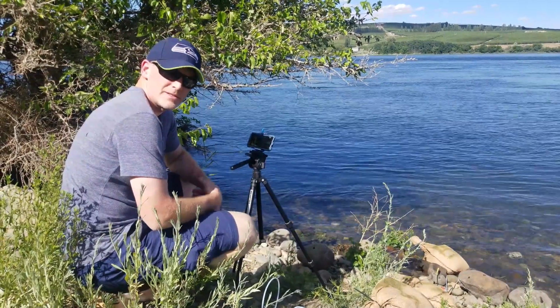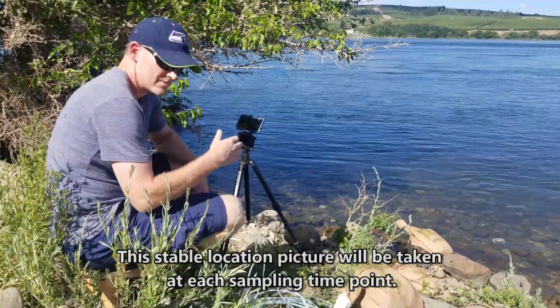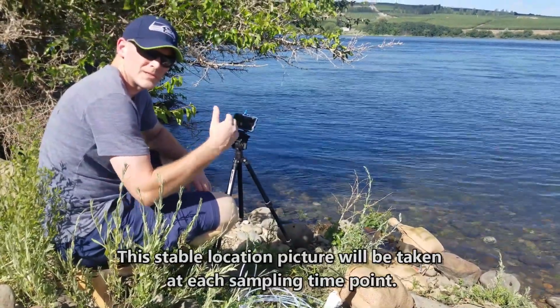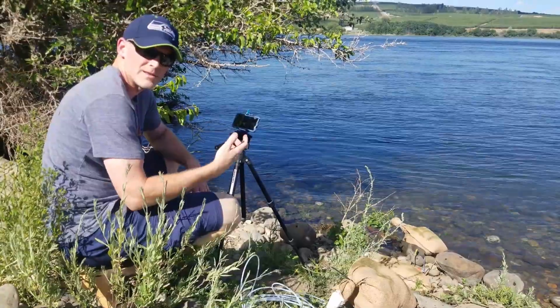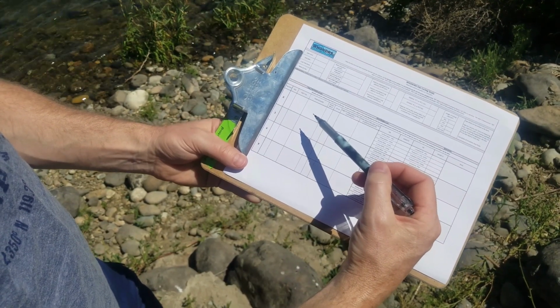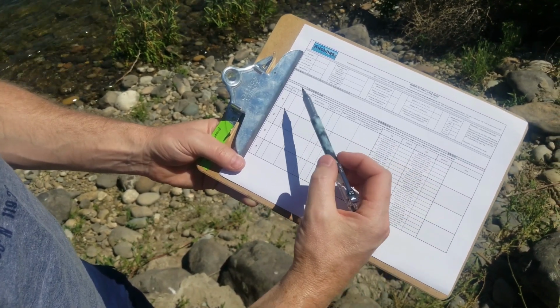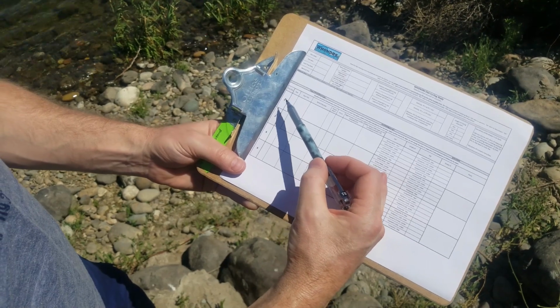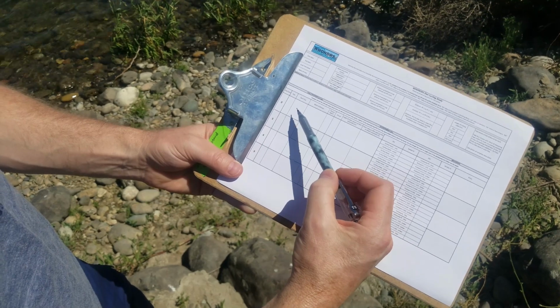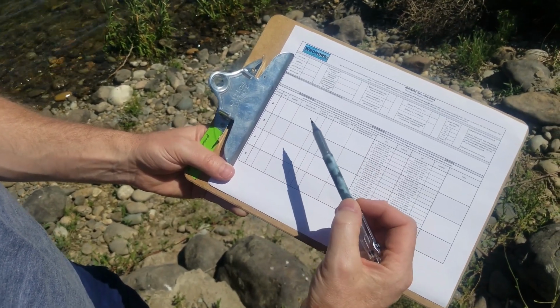another set of pictures you'll take is every time you sample, you want to take a picture towards the push points from the same location, same height, same everything, so we can get a time course of what the water stage is doing throughout the study. Before you take your photo from your stable monitoring location looking out to the push point, make sure you take a picture of the hard copy data sheet, zoomed in to the time point associated with the picture that you're about to take. You want to record the date and the start time. This way we can associate the time with the picture that's being taken.